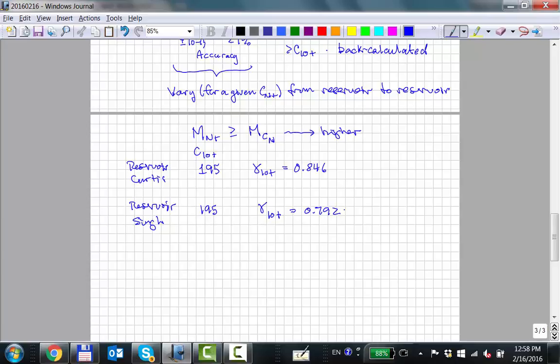Okay? Yeah. This is because of the isomers, right? It's because of the isomers, yeah. If it's a waxy, then most of the hydrocarbons are alkanes, and if it's aromatic, then they've got a lot of cyclics. So this would be more paraffinic. Maybe this is kind of normal, which has got a little of each. And then some other reservoir might have, let's see, aromatic oil.